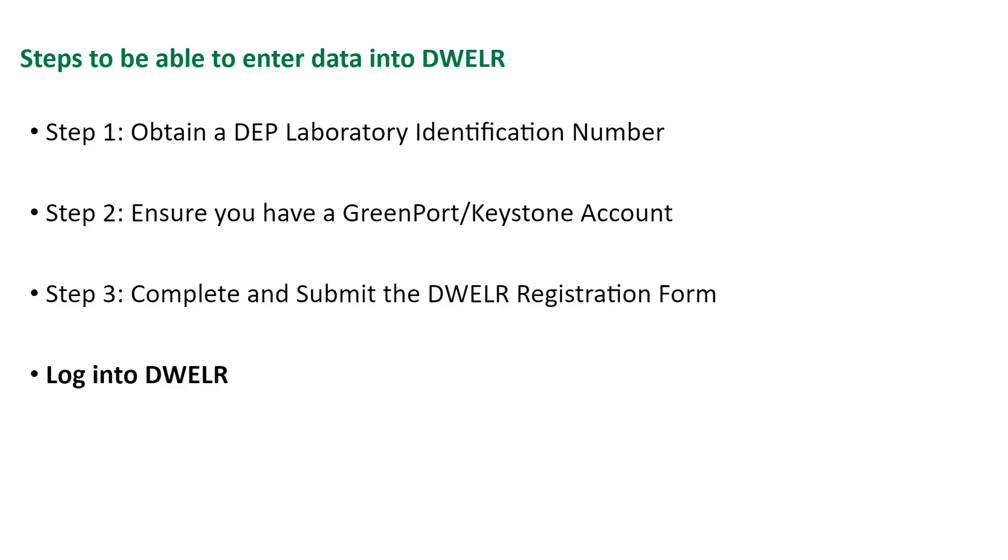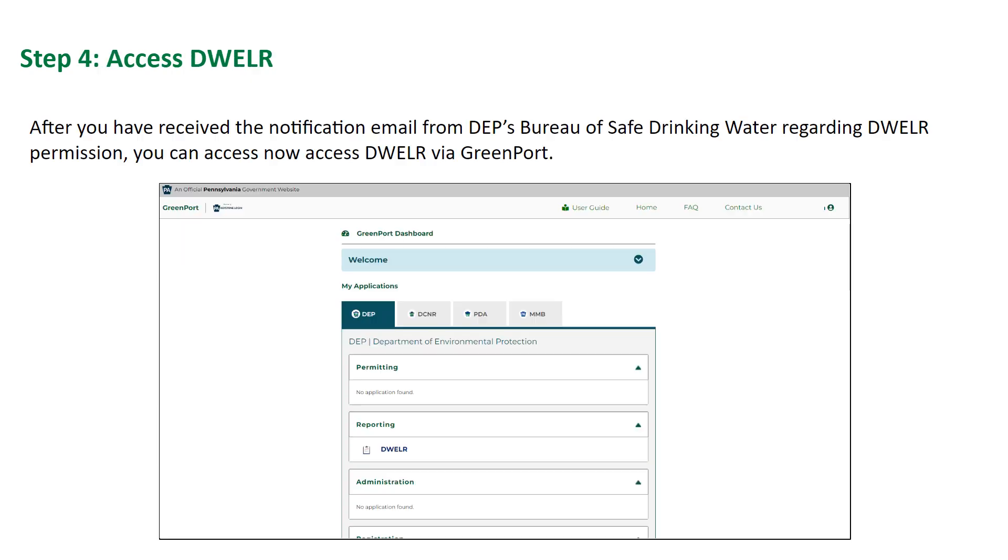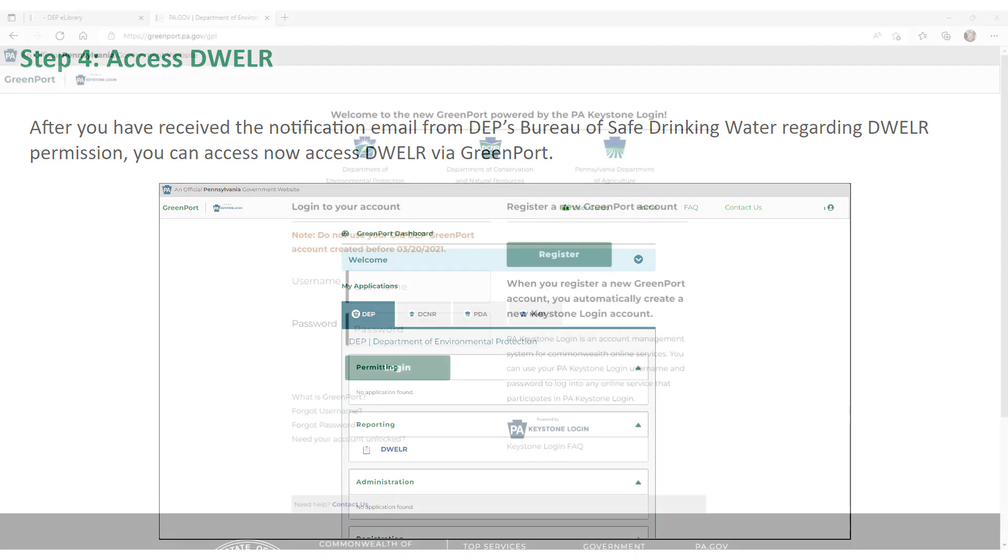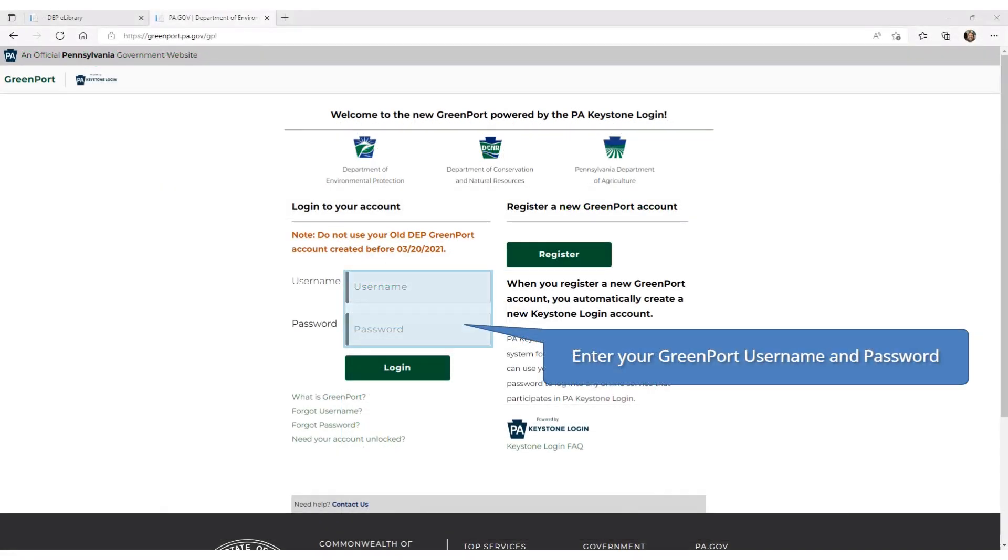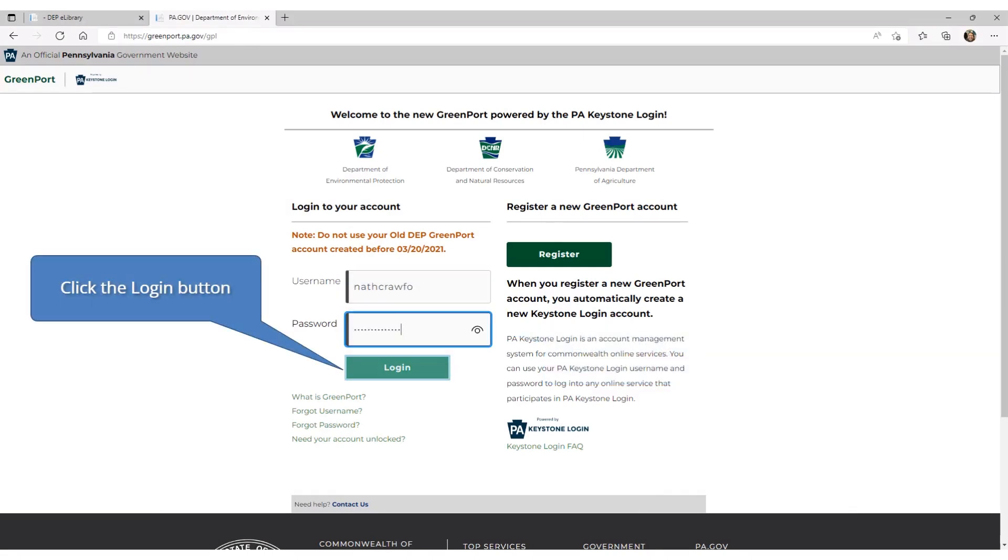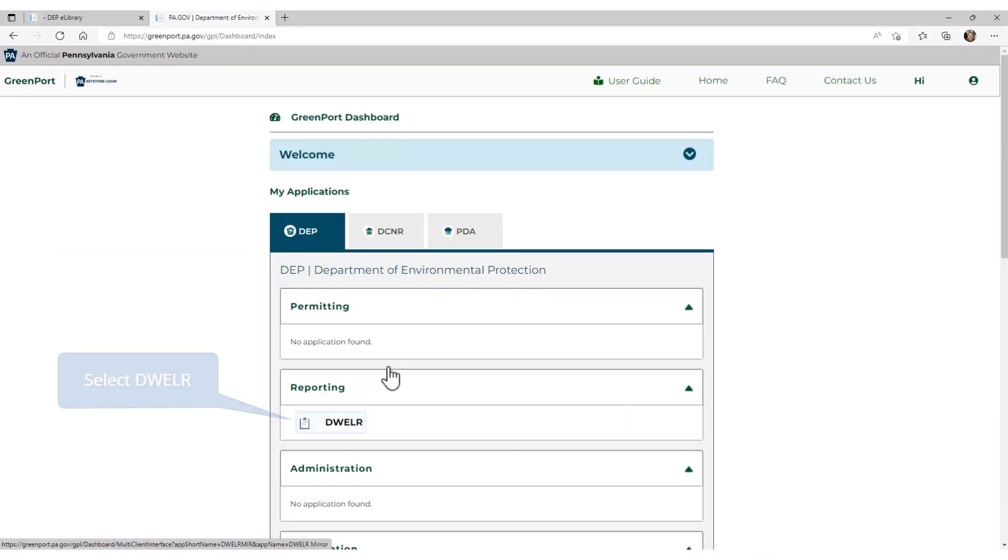Finally, let's go through how to log into DWELR. After you have received the notification email from DEP's Bureau of Safe Drinking Water regarding DWELR permission, you can now access DWELR via GreenPort. Enter your GreenPort username and password. Then, click the login button. Under the reporting section, select DWELR.